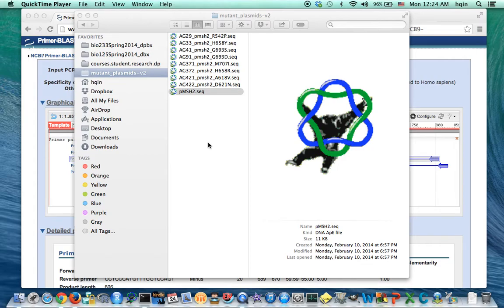I will show how to design a pair of primers that can be used to amplify the mutation region on a PMSH2 plasmid.